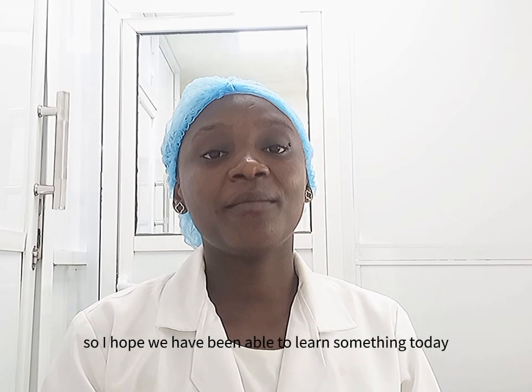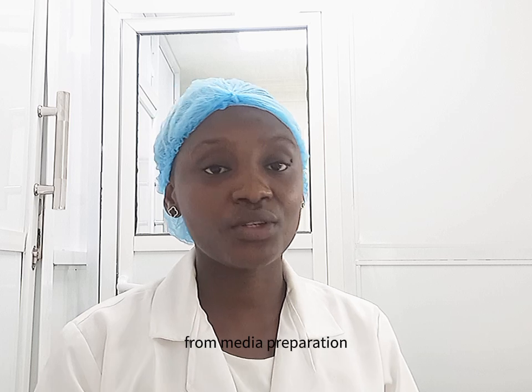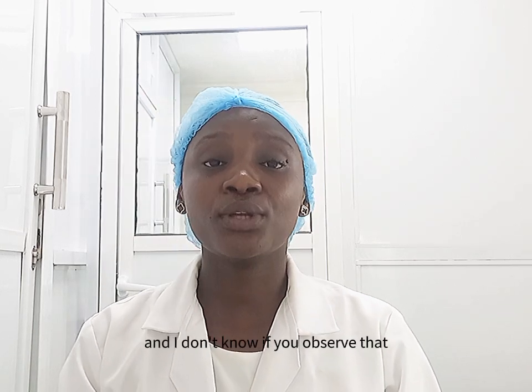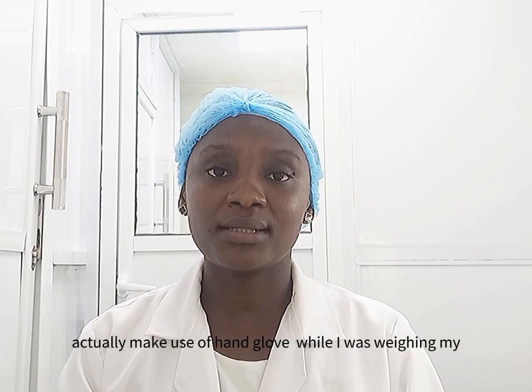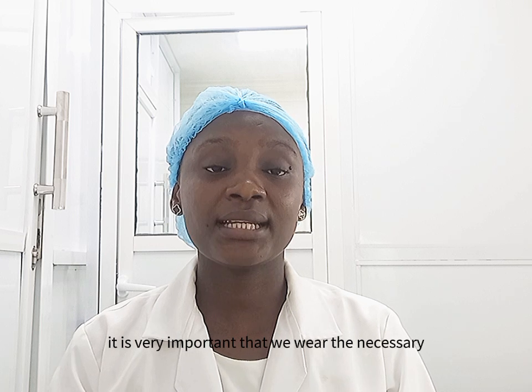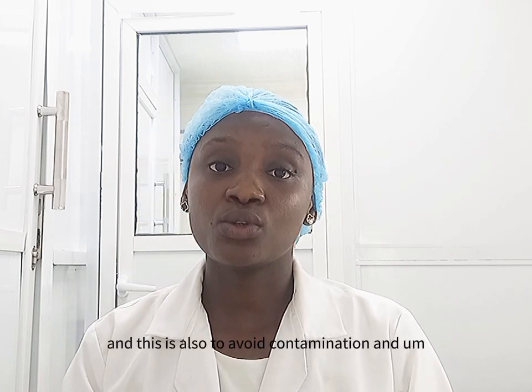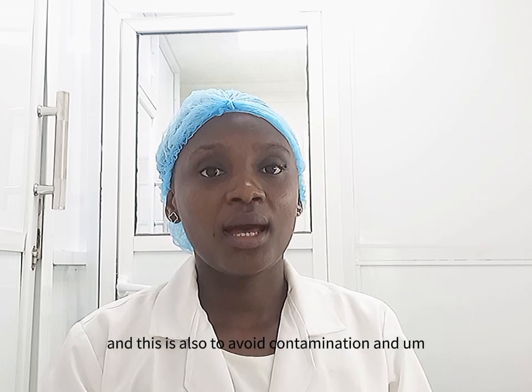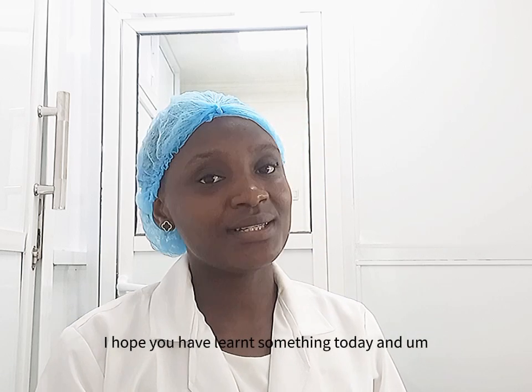So I hope we have been able to learn something today from media preparation, the calculation, the weighing, and I don't know if you observed that I actually make use of hand gloves while I was weighing my media. So it is very important that we wear the necessary protective equipment, and this is also to avoid contamination. And I hope you have learned something today.